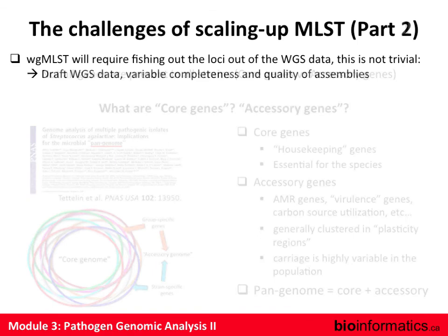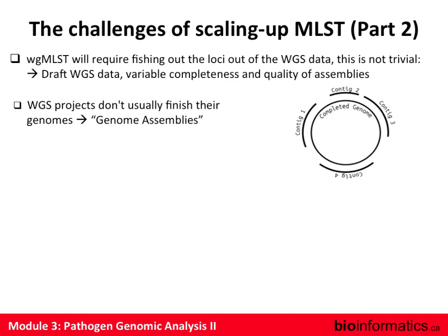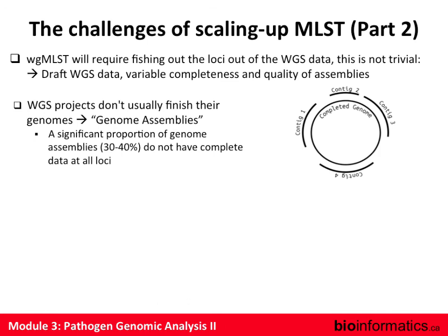But here's one of the problems with all of that. When we talk about genome sequencing, we're not really talking about whole genomes. We're generally talking about draft genomes, right? We sequence and try to assemble, but we don't fully assemble. Most genomes out there are just draft assemblies, which lead to fragments called contigs, but there are gaps in between. So most of the genomes out there are not complete.